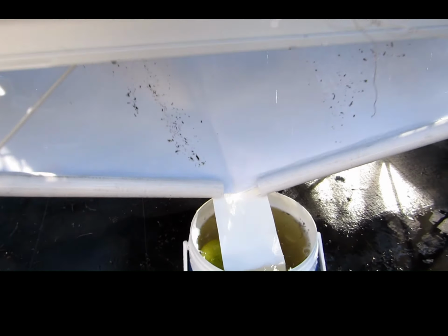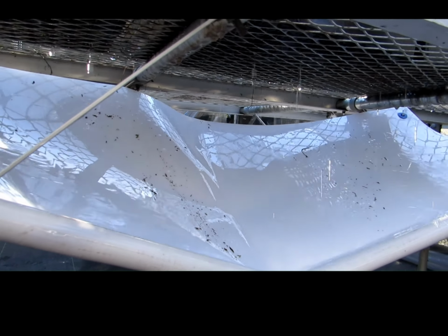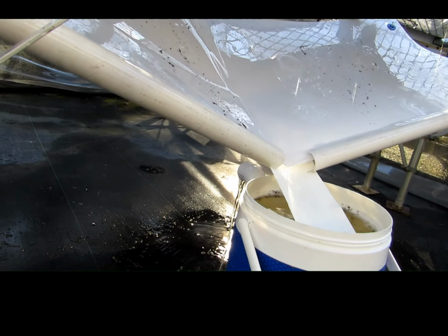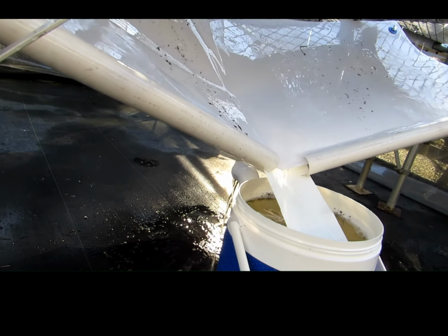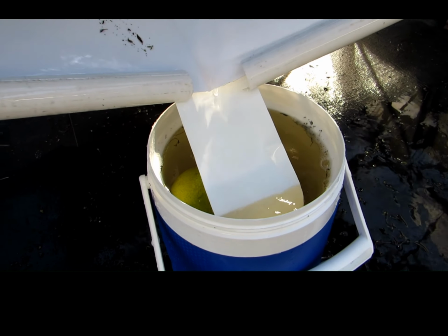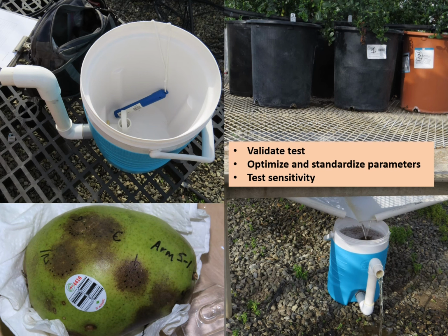So this video just shows the process in action. The plants above have been irrigated, and the water is leaching through. If these plants are infected, there's going to be zoospores dripping down into this vessel where the pear is floated, and it's not overrunning the rim. So we were able to come up with this concept, test prototypes, and determine that, yes, this is a viable way to detect Phytophthora.